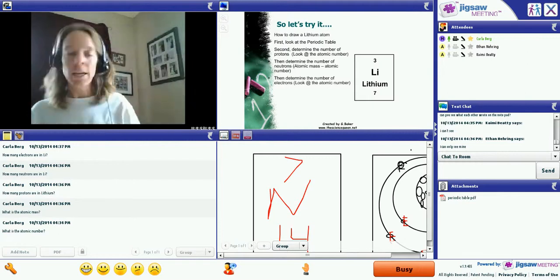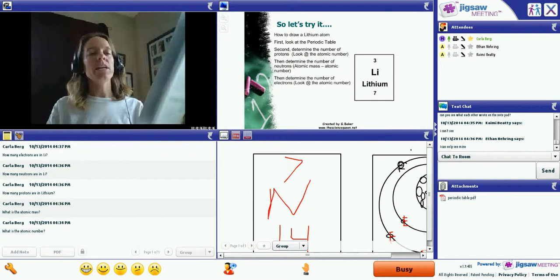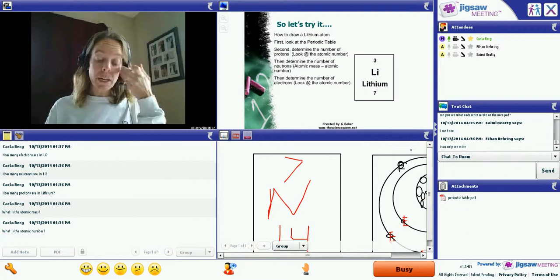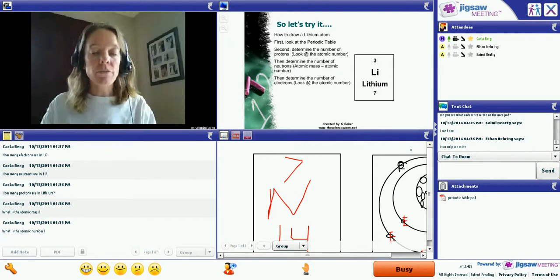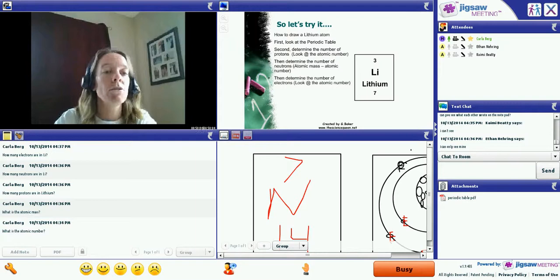We are going to be doing in your lab book, lab number 4, which is on page 26. So the materials you need are the 96 well reaction plate, your plastic toothpicks, and your small beaker, along with 4 of your reagents. Go ahead and get your stuff out next to you.